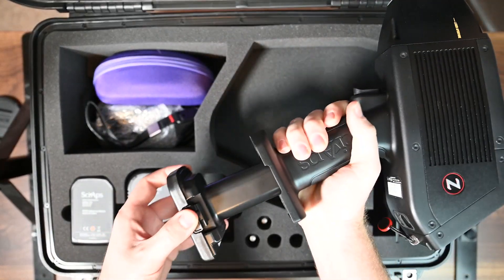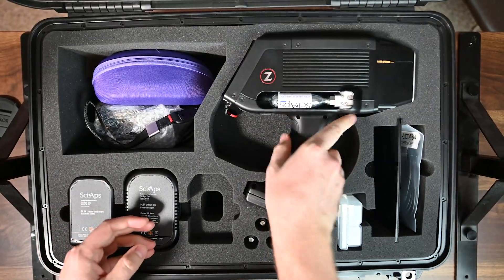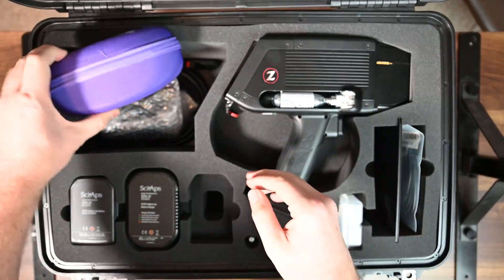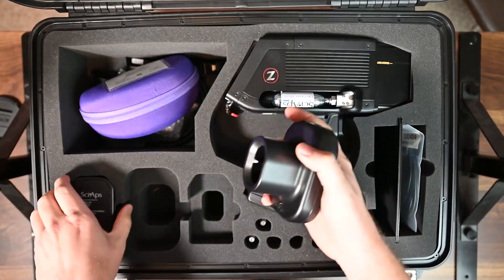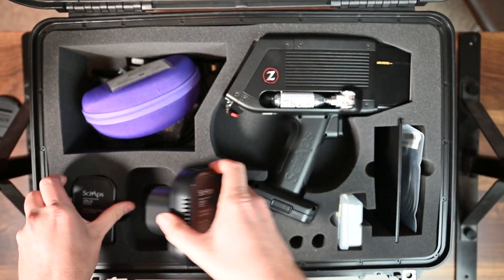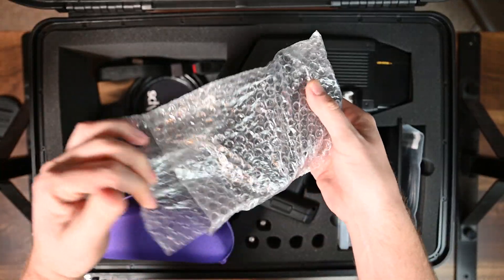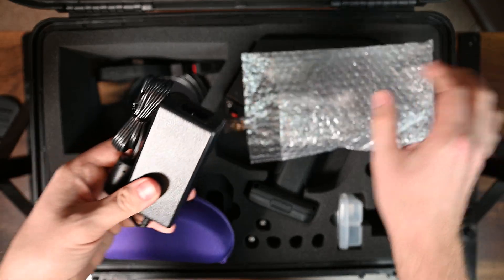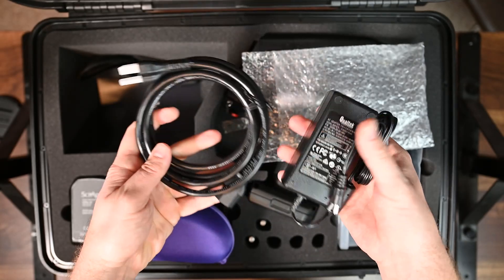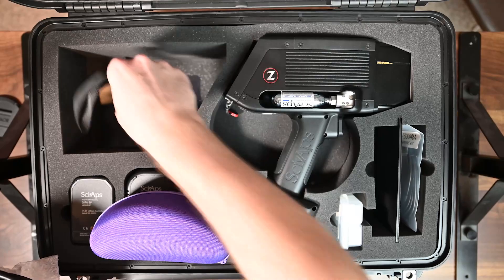The battery just clips into the unit and you're ready to go. You get about six hours of battery life if you're constantly using it, which is pretty cool. The battery charger units just slide right over the battery and plug in with an external power supply. Everything is wrapped up very cleanly from SciAps, and there's a power cord included as well.